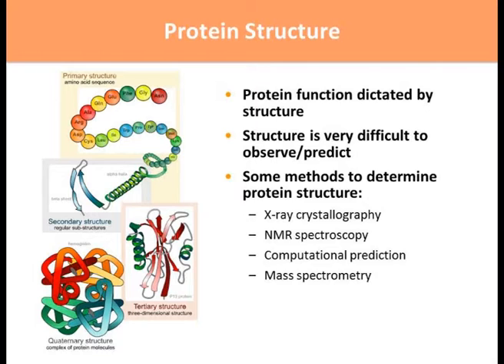And when we do shotgun proteomics, usually what we do is reduce proteins from this level here all the way down to the primary structure, and use just the primary structure for protein identification, and in some cases even quantification, as you learned today. But we never trace that information back to the actual quaternary structure. And this has been an interest of a lot of mass spectrometrists for over a decade now, I think, and they've always kind of considered, are there ways that we can get at protein structure from a mass spectrometer?